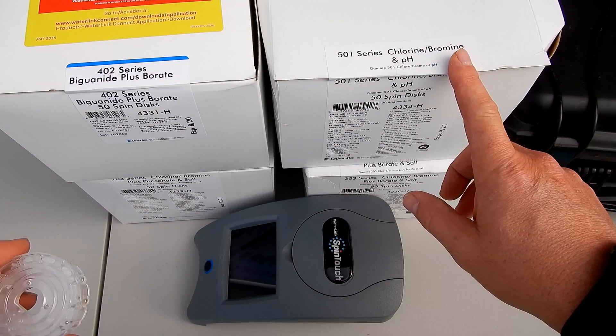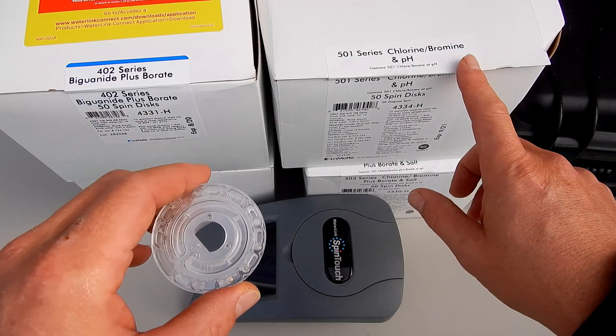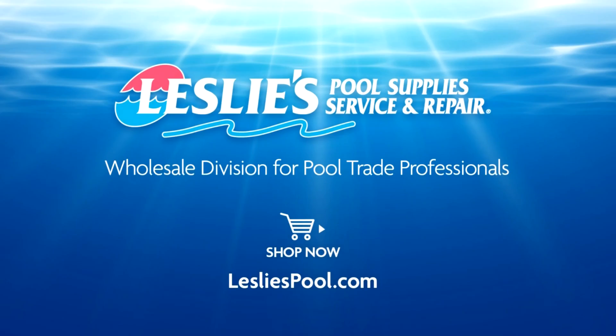So those are the different spin discs that you can use with the LaMotte Waterlink Spin Touch. In a separate video, I'll go over each of these particular disc sets and show you the test factors using the Spin Touch. Leslie's Pool Supplies has been do-it-yourselfers' and pool trade professionals' trusted partner since 1963, providing quality products and services to make pool care easy, and solutions and expertise to do it right.